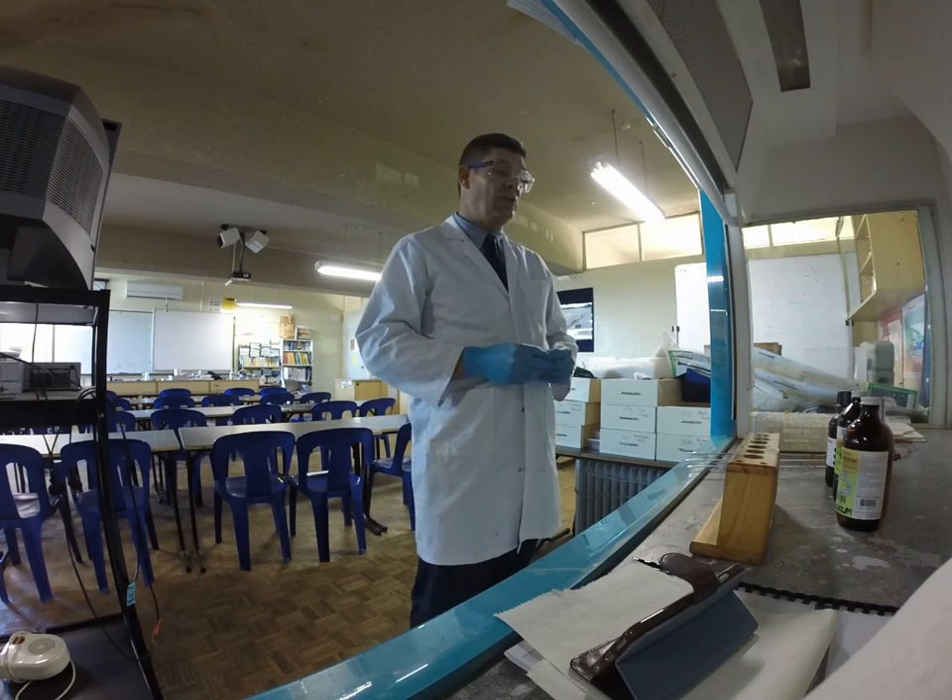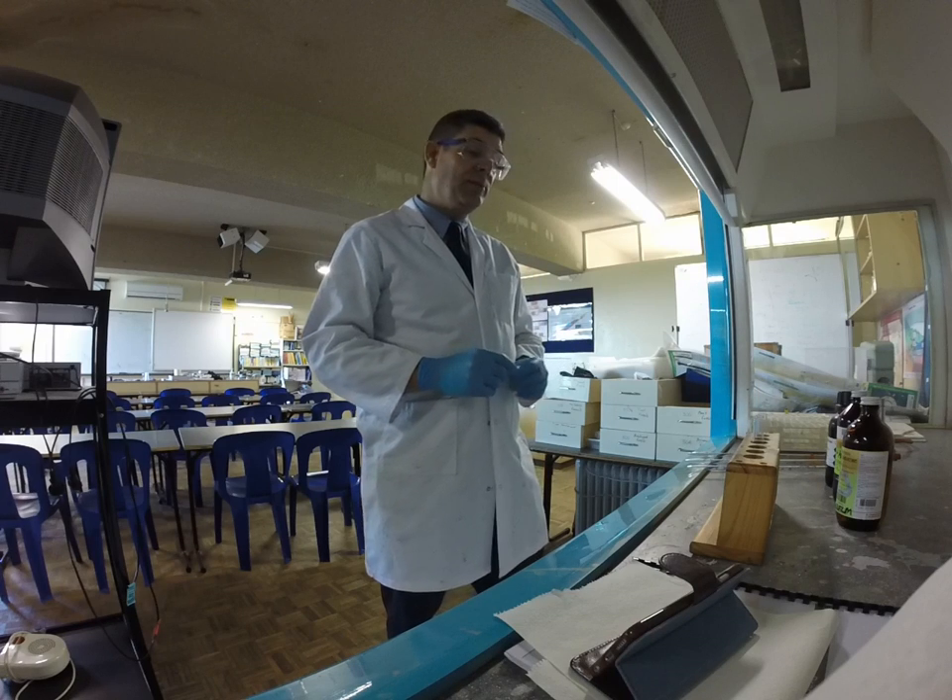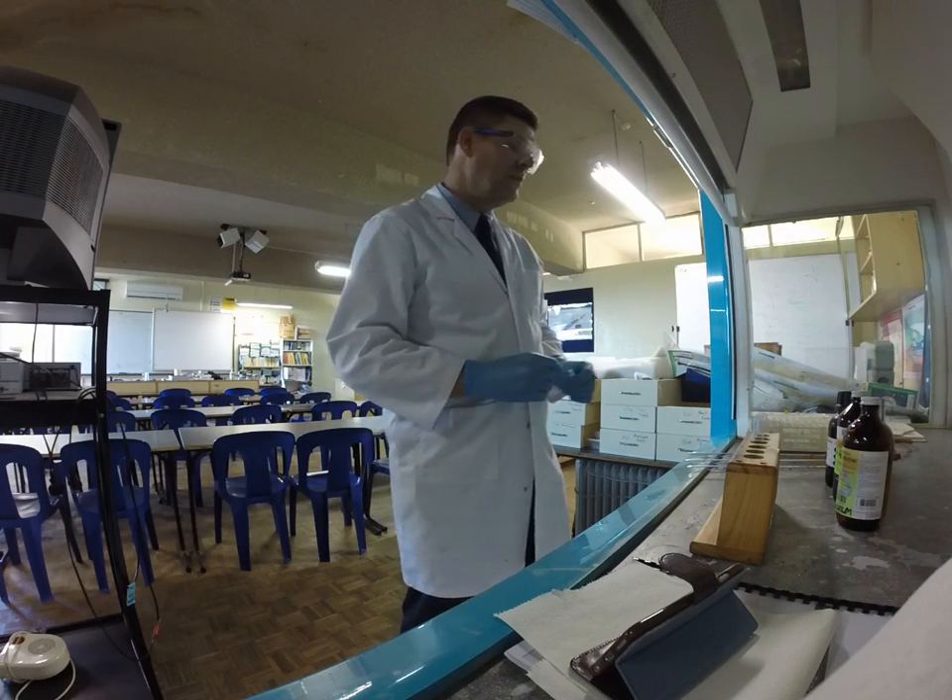These tests are used to determine the presence of the double bond, because the double bond is more reactive than the single bonds.